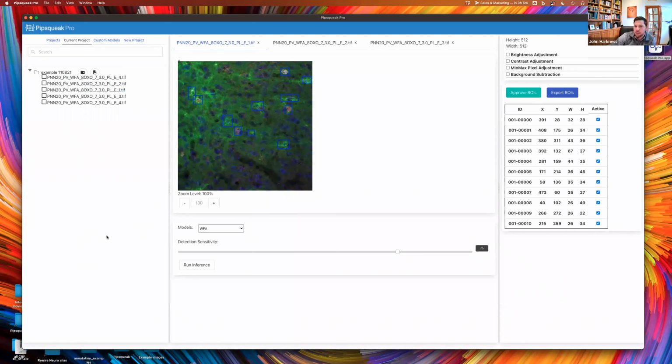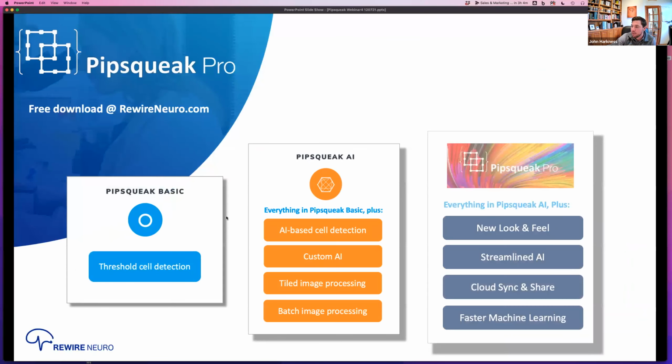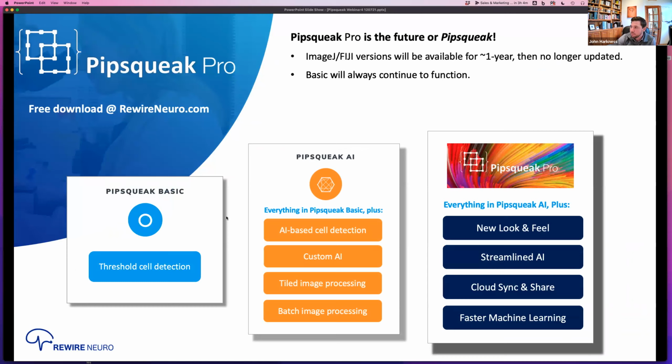Yeah, and so in terms of accuracy, I think there's really two parts to that question. This is actually a really good segue over to the next thing that I want to discuss. Let me come back to that.